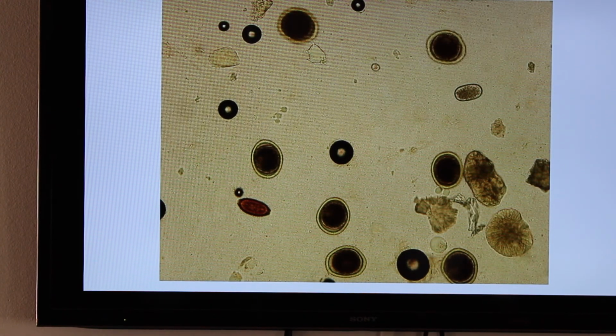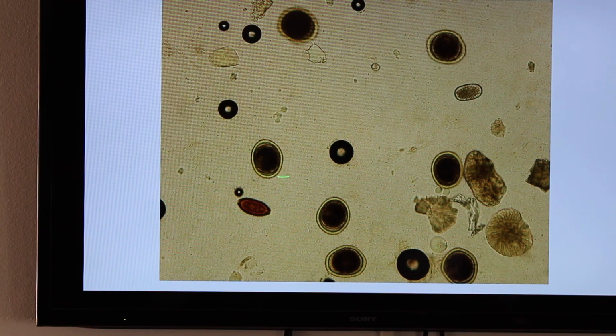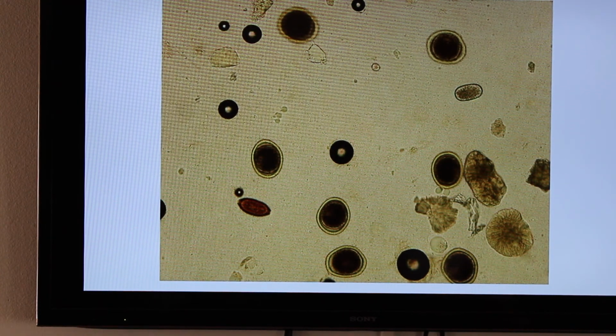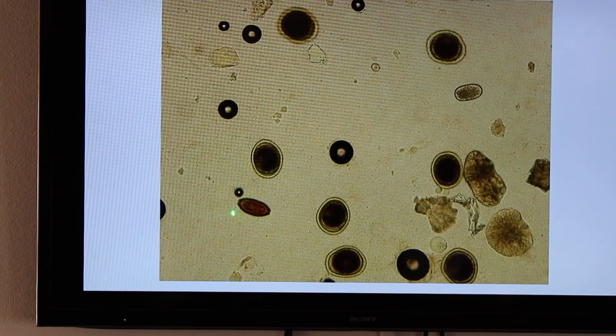And here's another little party picture. So looking at our size, our big large guy is the first thing that catches your eye, right? So we know that these are our roundworms. And then look at our little hookworm buddy hanging out here. And then shoot, a little whipworm, Trichuris vulpis, found its way in.